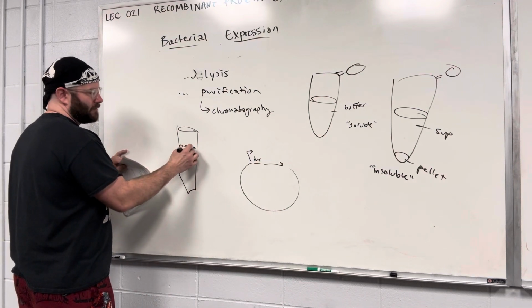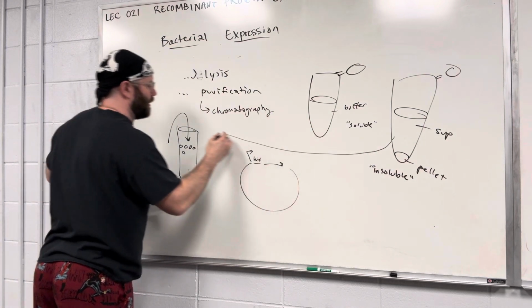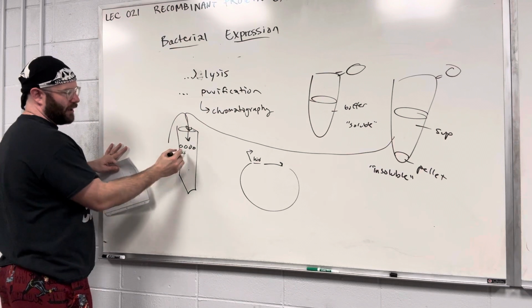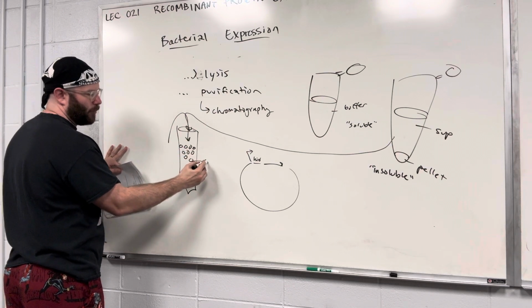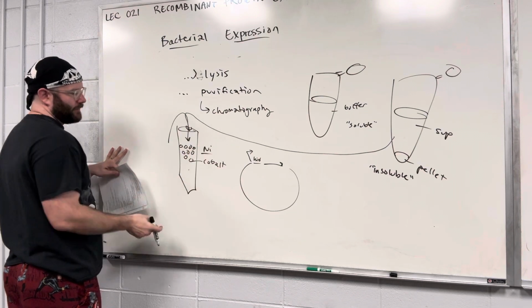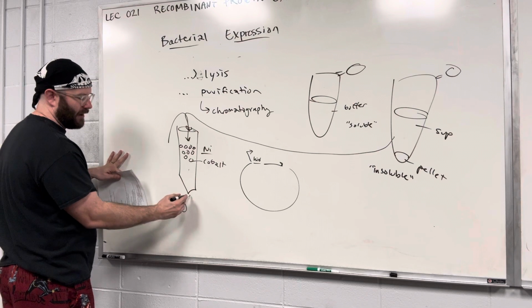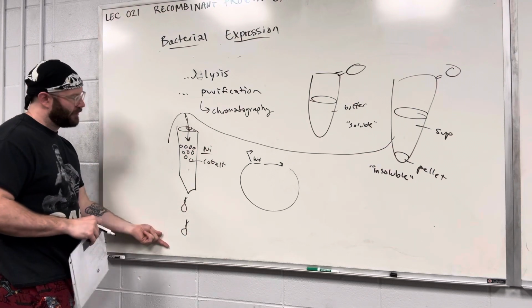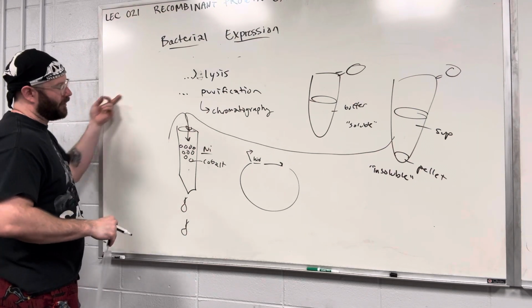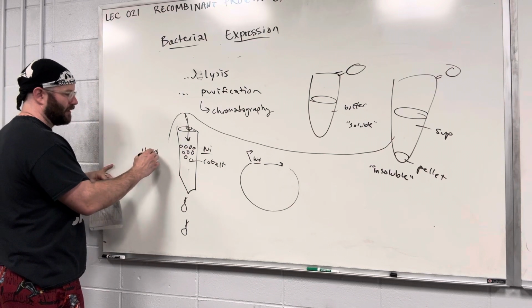That allows you to run that protein in the supernatant. You take the supernatant and run it over a column that has cobalt beads, or sometimes nickel beads. Your protein will stick to the beads while everything else drips off, and then you can run buffer over this to do what's called a wash, to wash your protein.